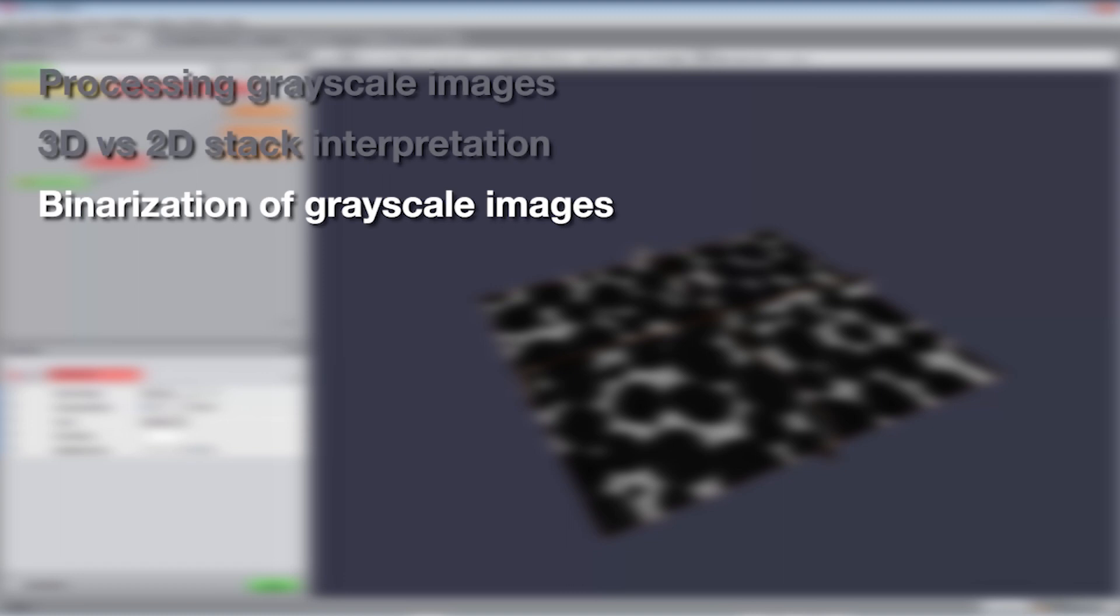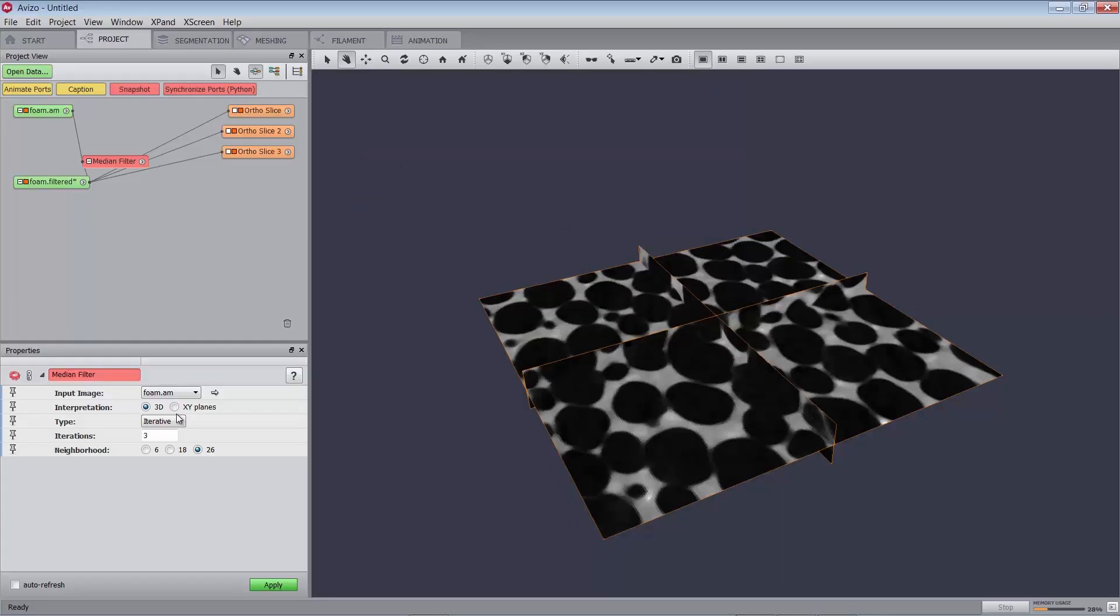Binarization means transforming a grayscale image into a binary image, that is, a label image with only interior and exterior materials. Threshold binarization is used when the relevant information in the grayscale image corresponds to a specific gray level interval. Thresholding is a simple segmentation method. More sophisticated automatic, semi-automatic, or manual segmentation tools are also available in Amira and Aviso.